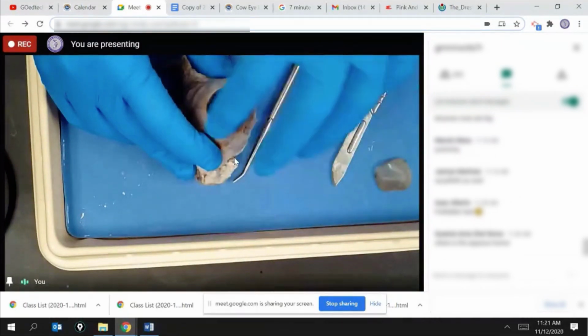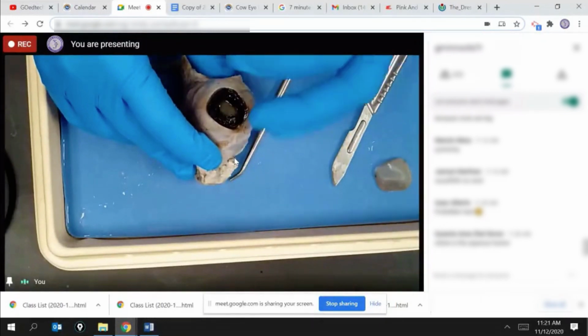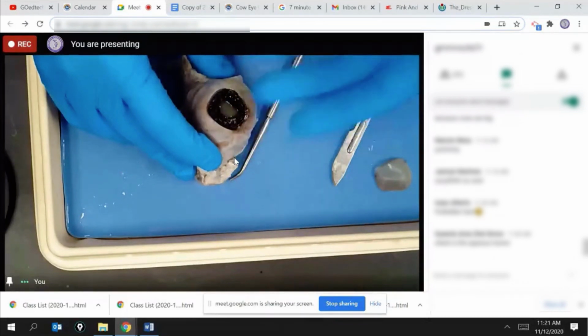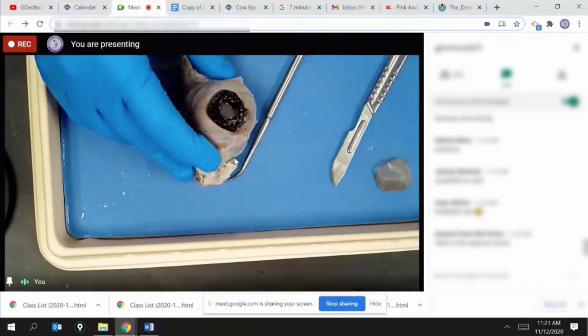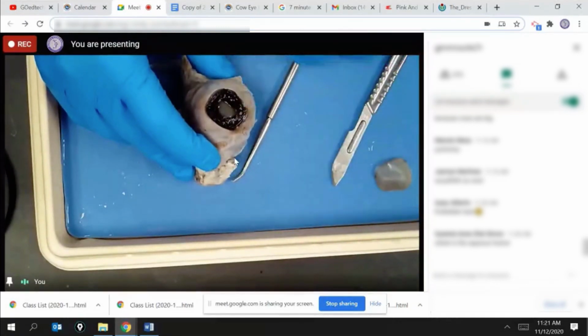And so this kind of monitors the amount of light that comes in. And so it has these muscles that pull on it, right? These ciliary muscles that pull on it so that it can open and close or regulate light. As we walk into a dark room or into a light room, you're going to see this pupil start to get larger and smaller.